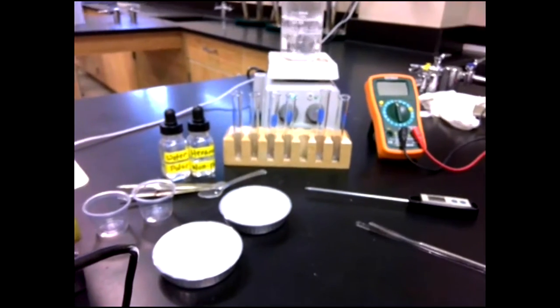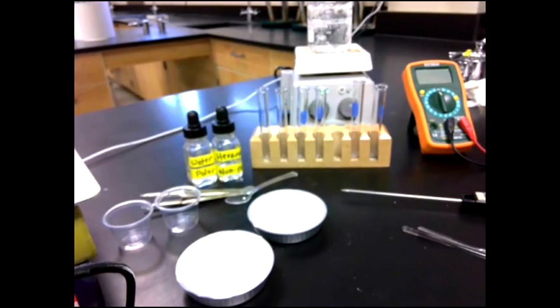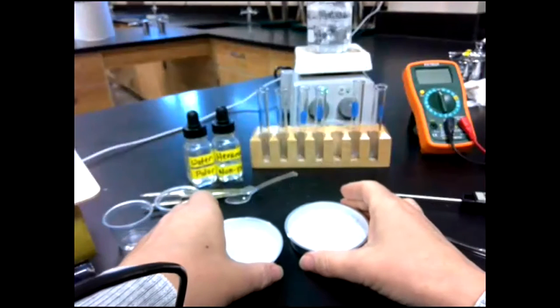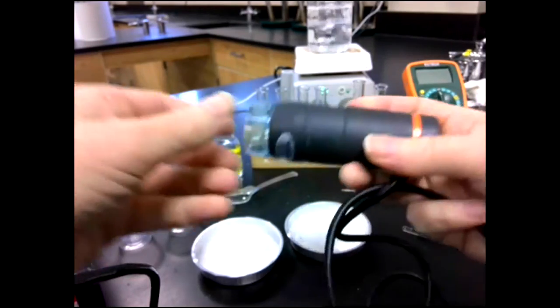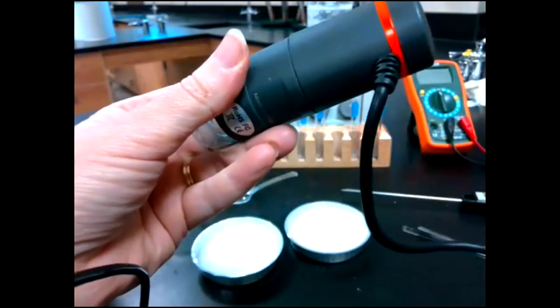Okay, so I will work here. Let me put some glasses on. So things we're gonna do, so here are the two solids and I'll show those to you up close. The first thing we're gonna do is observe them and use this guy here. It's called a digital microscope. It's like that little handheld microscope.